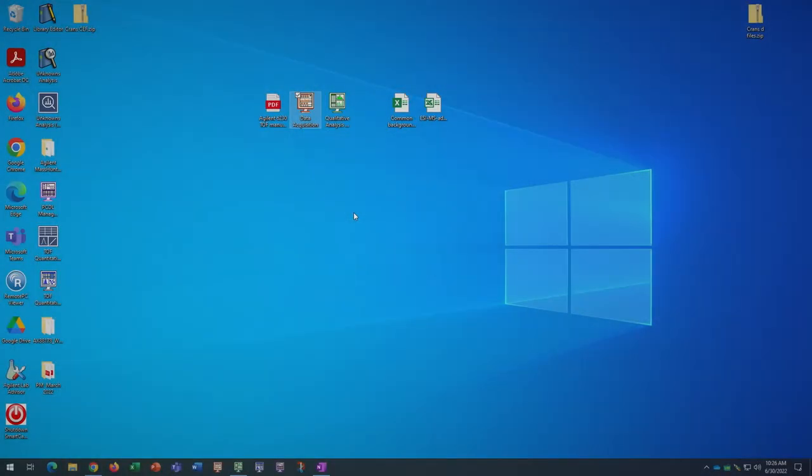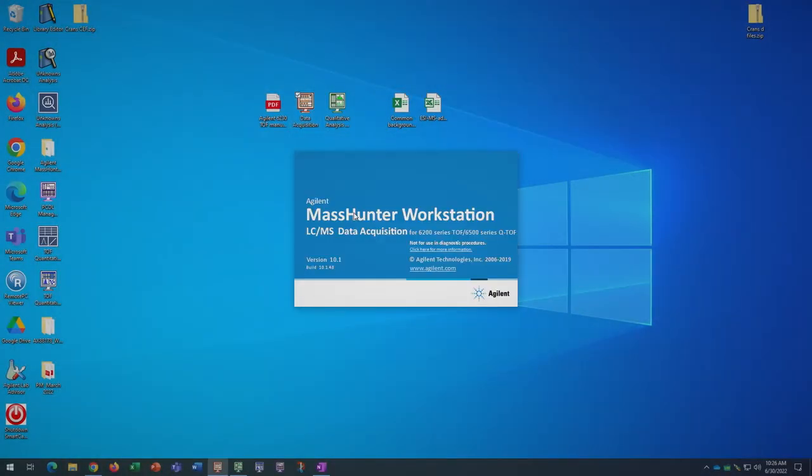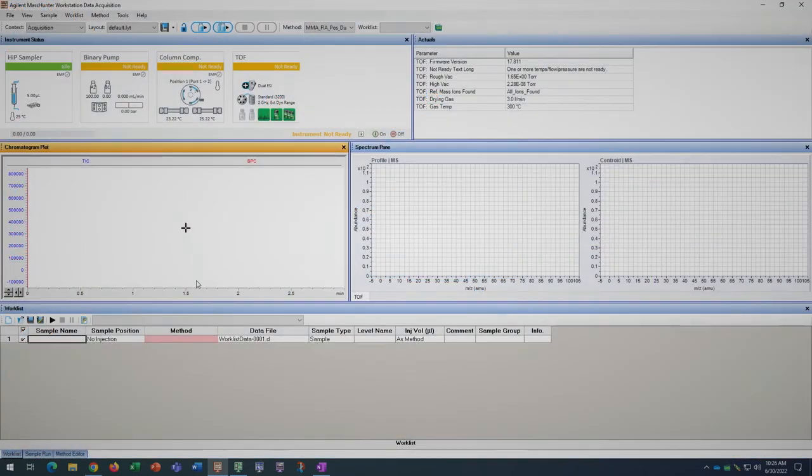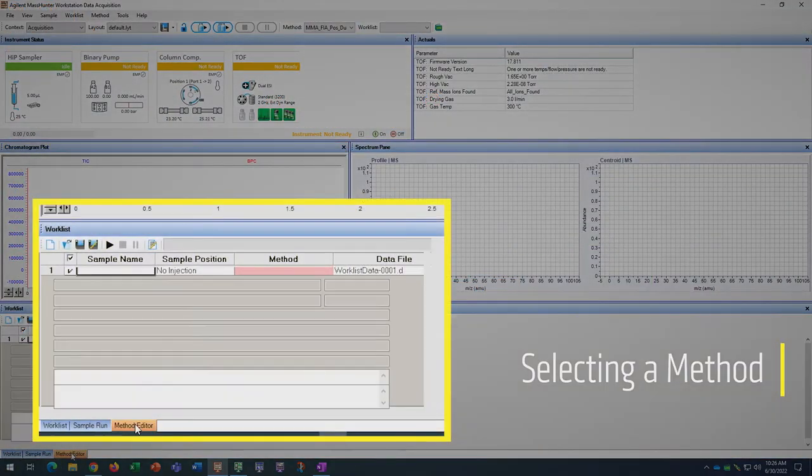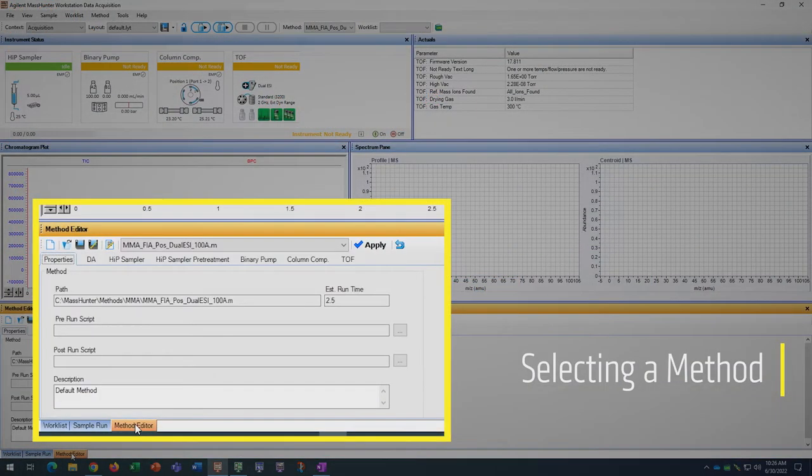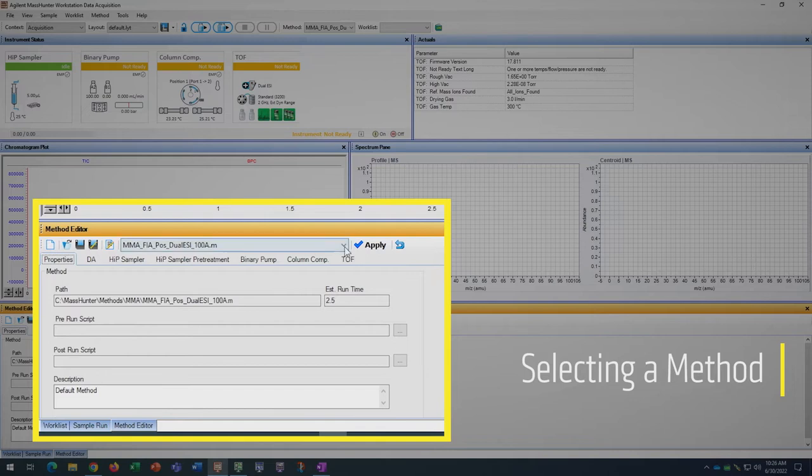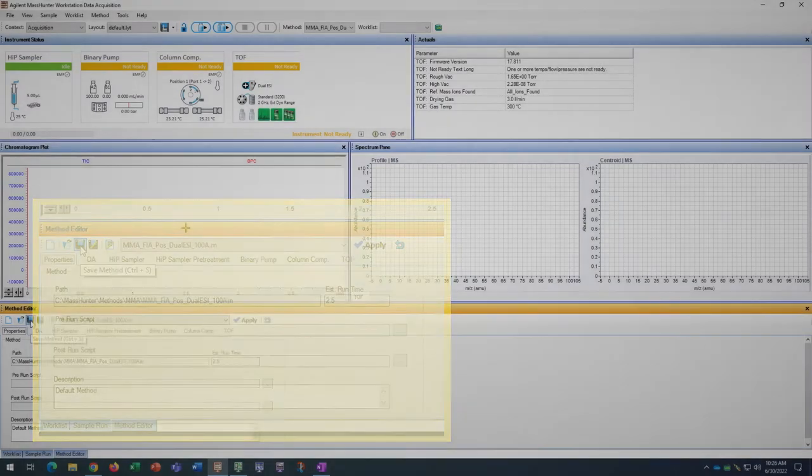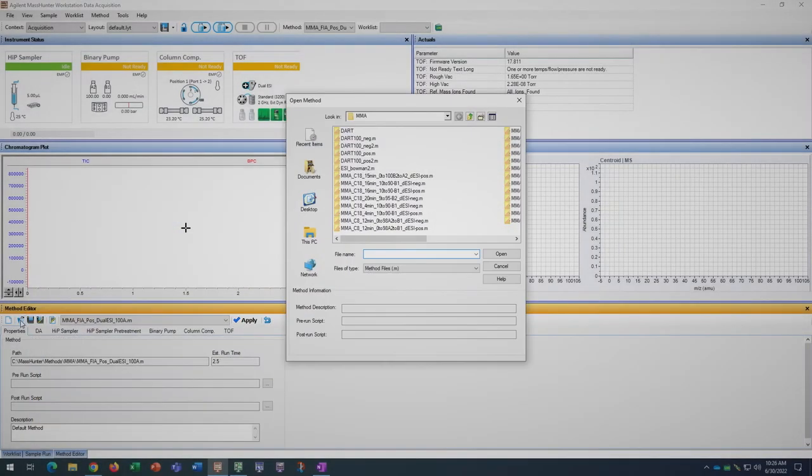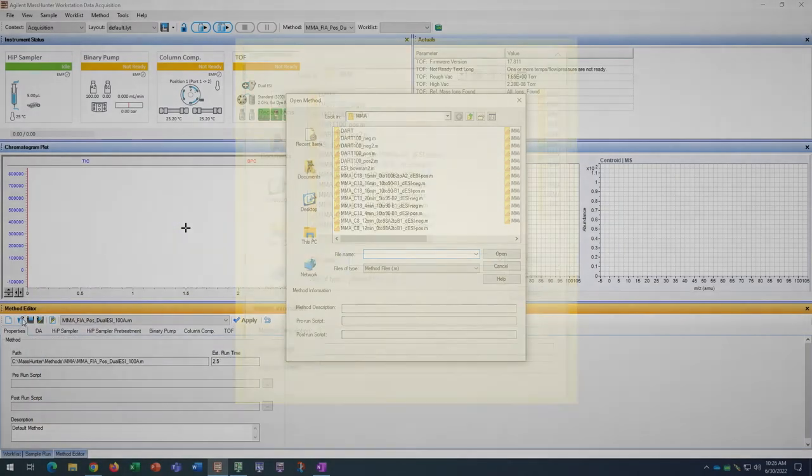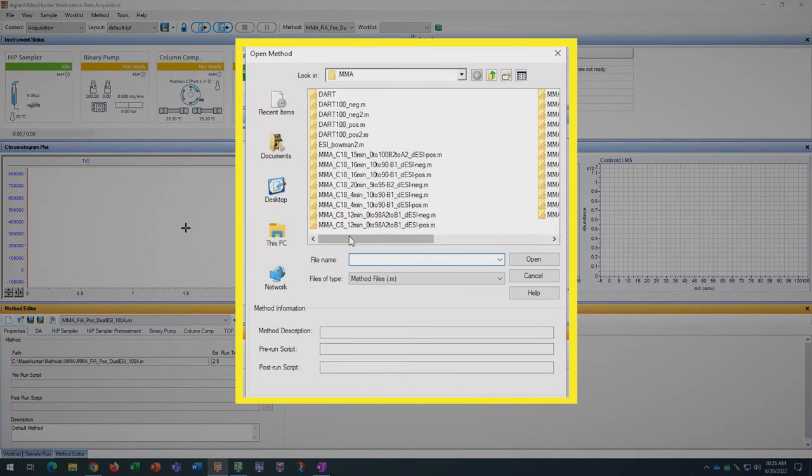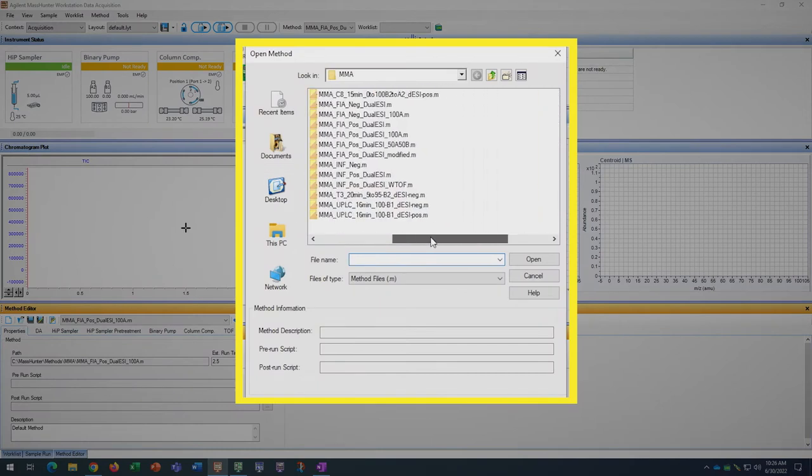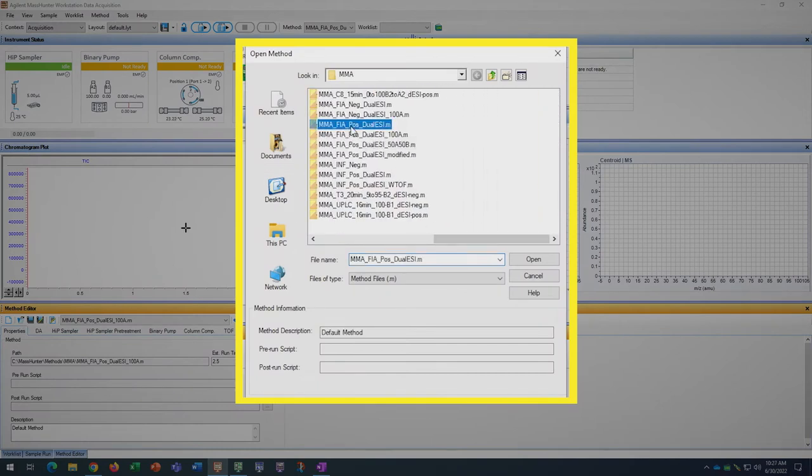In Agilent MassHunter data acquisition, the first thing we are going to do is load our method from the method editor tab at the bottom and make sure it is using the correct solvent bottle. There are many methods available on this instrument, but today we will be using MMA FIA POS DUAL ESI.